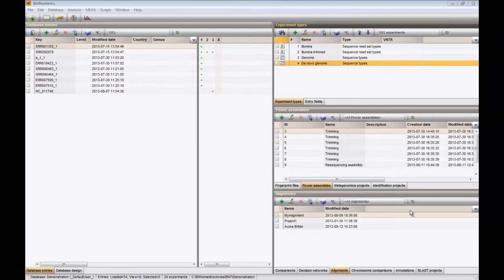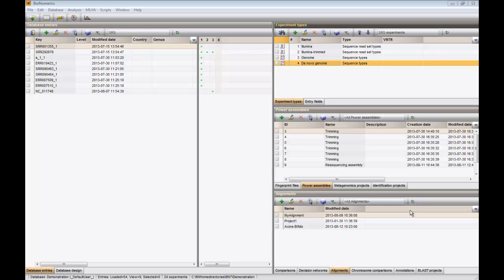In this video, I will show how to calculate a de novo genome assembly in BioNumerics. To perform a de novo genome assembly, we only need the preprocessed dataset that was used to illustrate the trimming feature.